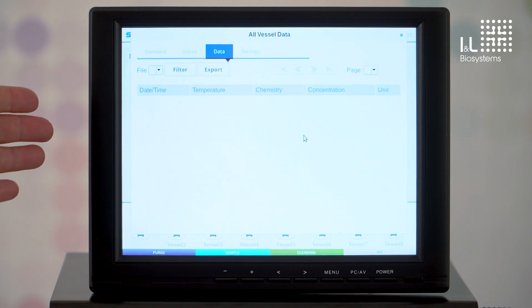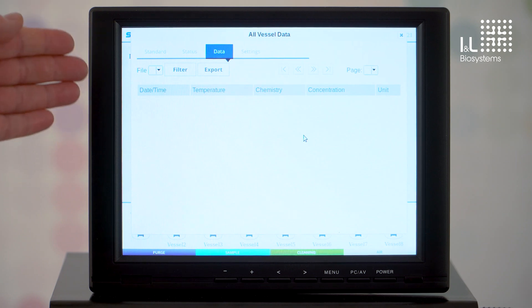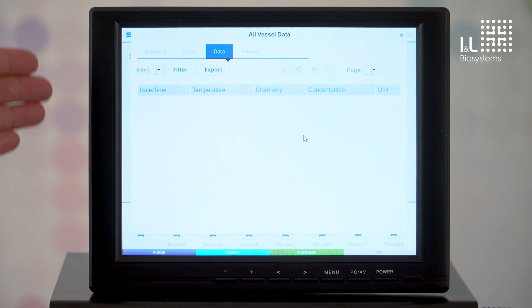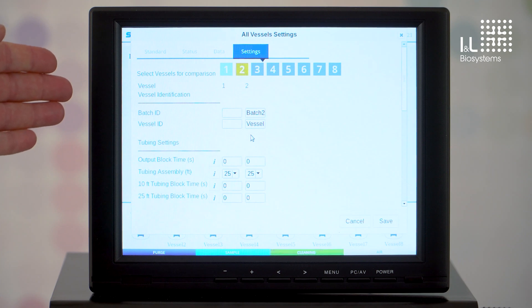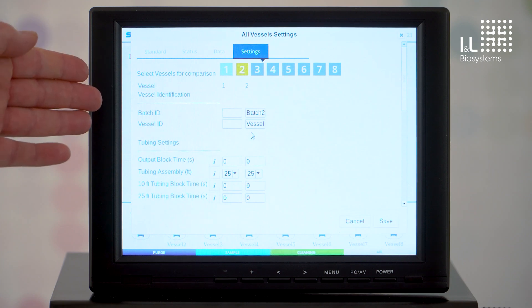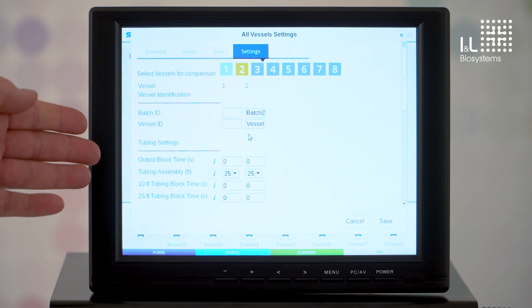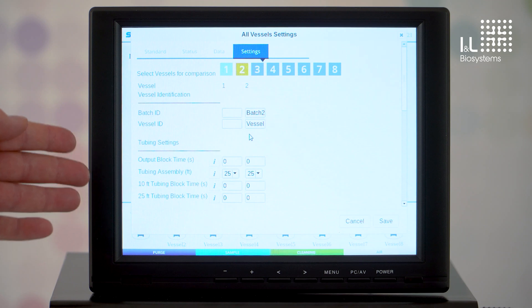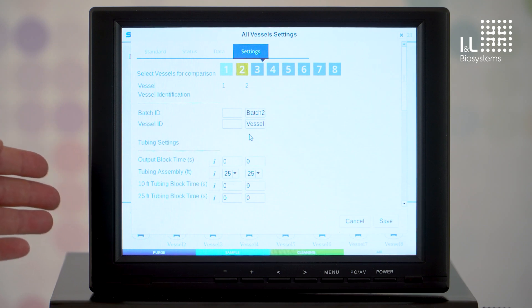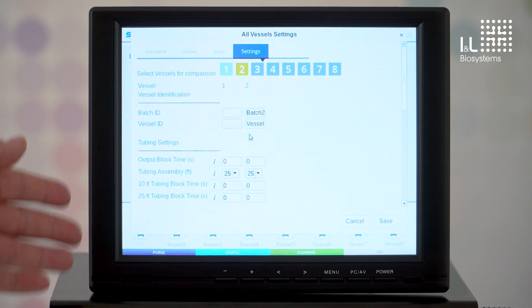If you have an analysis system connected to the SecFlow, you will be able to see which measurement results the system has sent to the SecFlow in the data menu. In the settings menu, you can, for example, assign a batch ID or a vessel ID. You can also adjust various settings to optimize the entire sampling process — for example, which tube length you have, whether it is seven or three meters long, and so on.